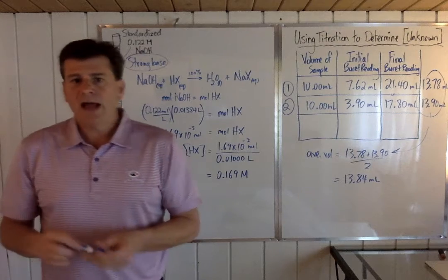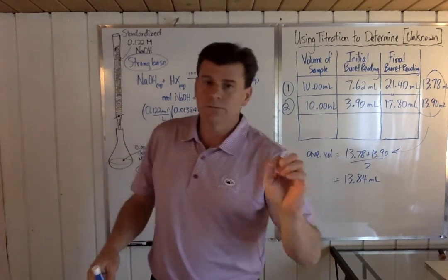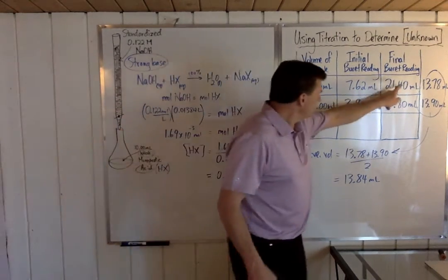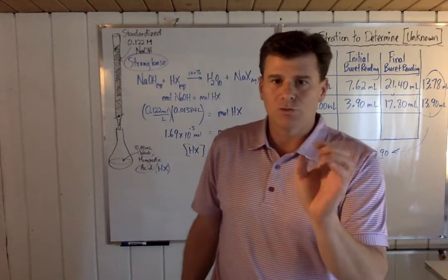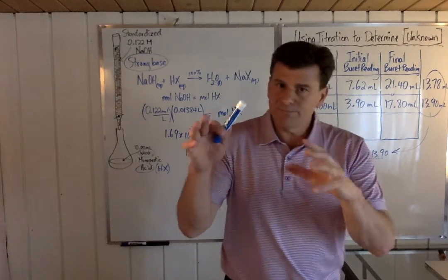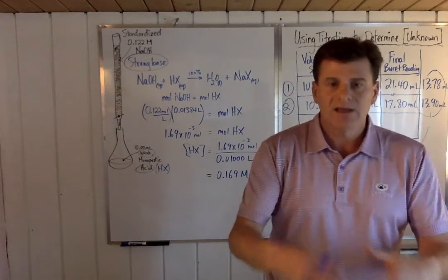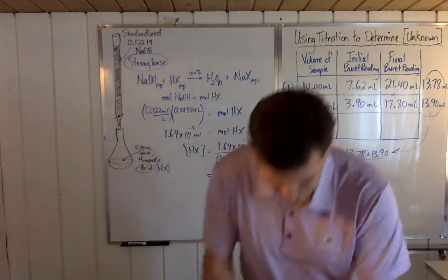So how careful you are with your titrating and actually getting to that equivalence point properly, making sure that this value right here is done in a very controlled fashion with skill, kind of plays out in what this number ends up being. Okay, so it's kind of critical that the technique allows you to get a good, accurate answer. Okay, so there's the first one.